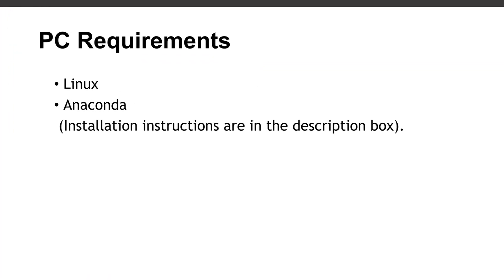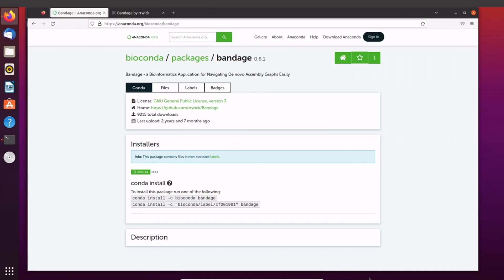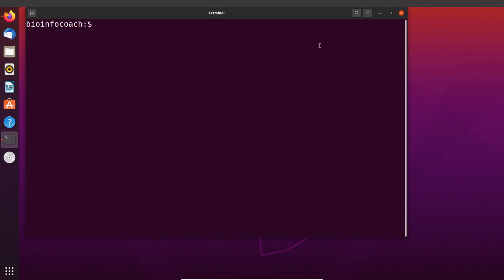In order to follow this tutorial you need to make sure you have Anaconda installed on your PC. I have tutorials that show how to install Anaconda, so check the description box and you'll find links to those tutorials. Now let's open our terminal. On the terminal, the first thing we will do is to add our conda channel.